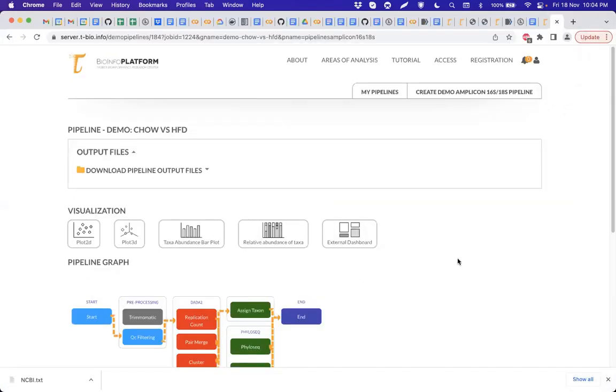You take only the sequences, identify the similarity levels and then cluster them. That gives you OTUs. But when you cluster, you look at the probability of these OTUs being together, and based on that probability you create distances between them, and you use those distances and the sequence level to define which ones form different clusters. That is your ASV in QIIME2.